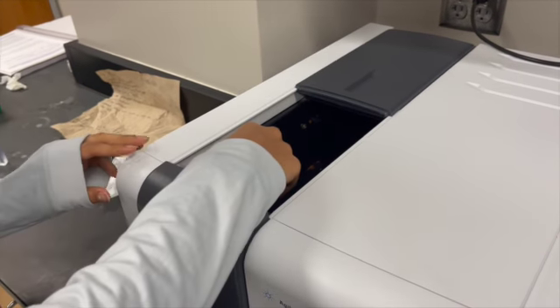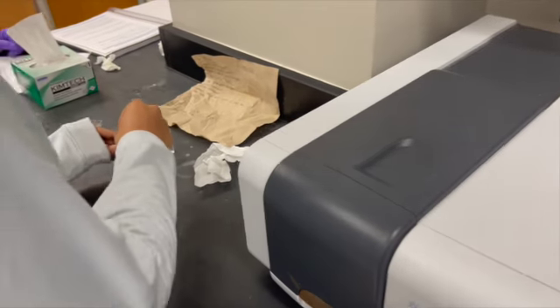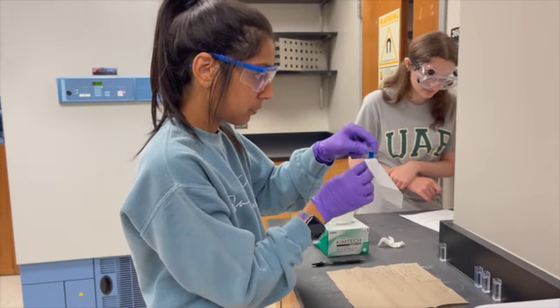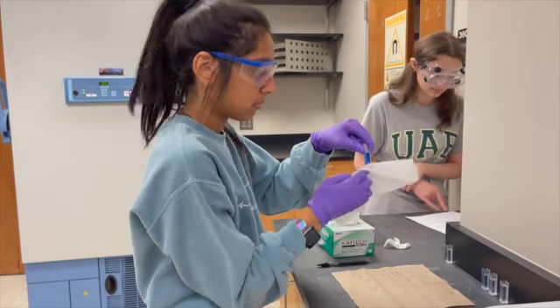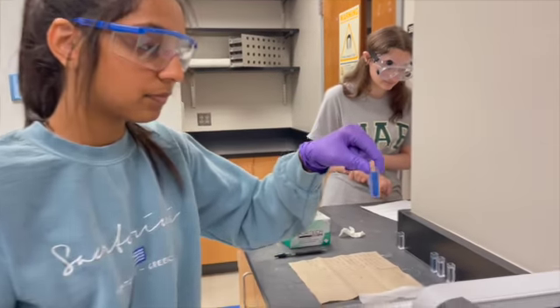We removed the cuvette from the spectrophotometer and then closed the door shut. We continued to clean the two sides of the cuvette with the chem wipe, then we placed the cuvette in the spectrophotometer with the clean sides in the beam. We then closed the spectrophotometer door before scanning, and then we scanned the absorbance of the six diluted solutions.